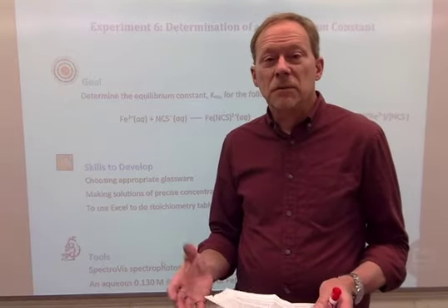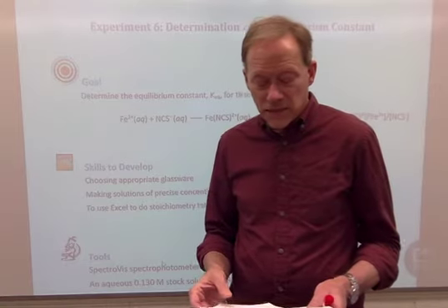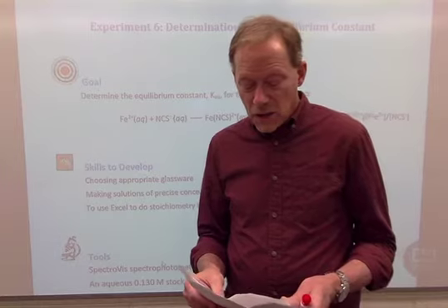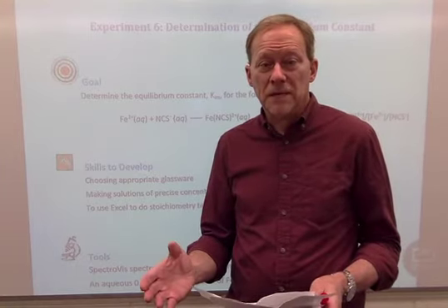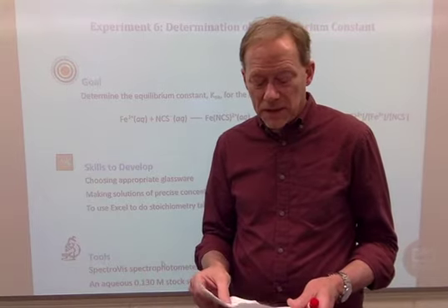Later in this module, Professor Tadko is going to show you making the measurements of absorbance as it's written in the lab guide, so you'll be able to see how we make these measurements. I'm just going to introduce the ideas that we're going to talk about in this lab.